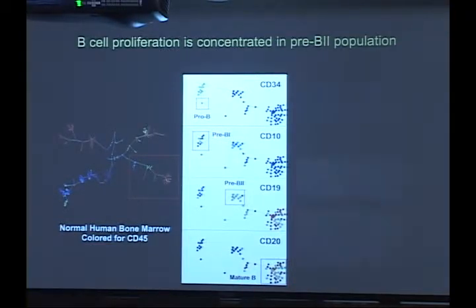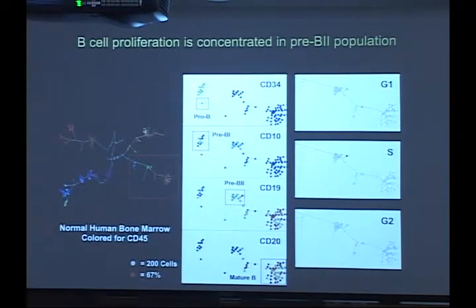Once we've defined these populations, I now have colored the tree. I've made the size distribution of the tree absolute. Now, when we typically display these plots, the size distribution has a minimum enforced so that the circles can't get so small that you aren't able to see the colors. Here, I've taken that away.